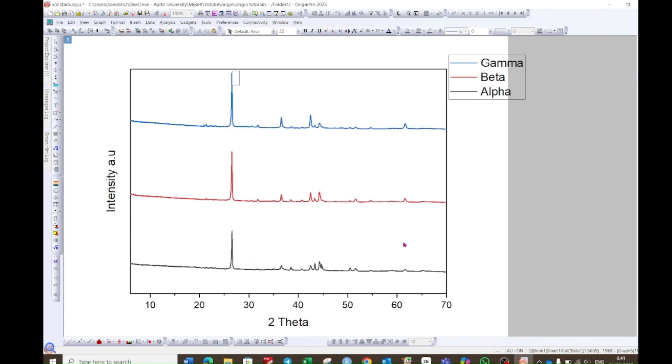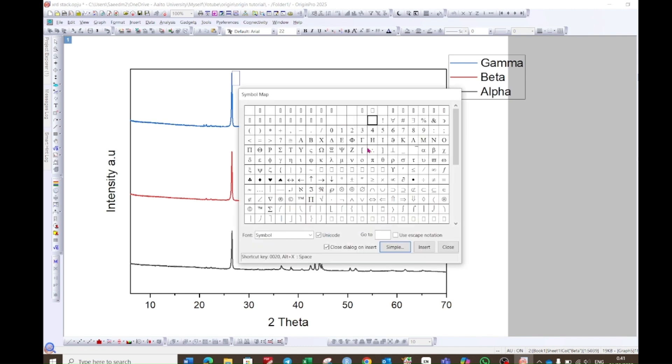If you want to choose different symbols, go to this advanced option. A number of symbols will open. Choose the one that you want. For example, here I want this one and press insert. A symbol will be inserted.